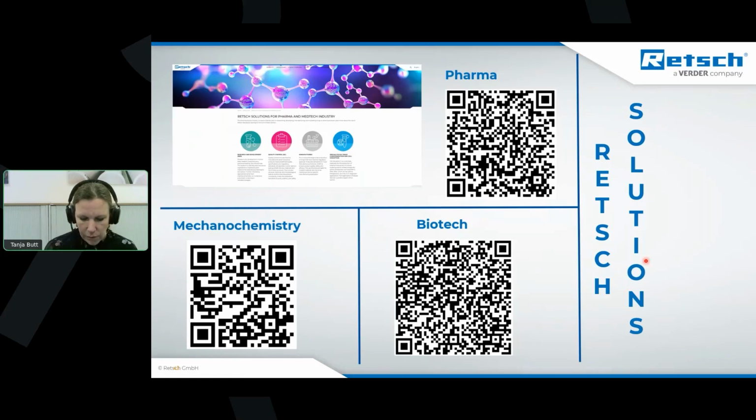Then there was also a question about fatty sample material. Again, jumping back to quality control, when you have to crush fatty material, if liquid nitrogen and brittling also helps, yes, it also helps, but it is a little bit trickier maybe than when you have sticky materials. Fatty materials, you can also, of course, brittle the fat. And then it is also not that sticky anymore and does not lead to this smushy, smeary material. What you can also do is work with talc or talcum.